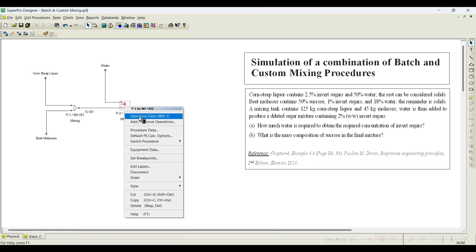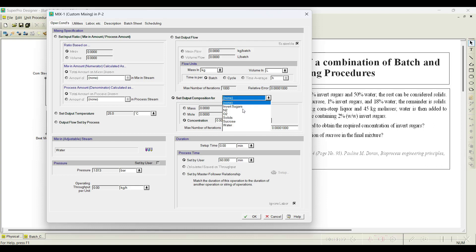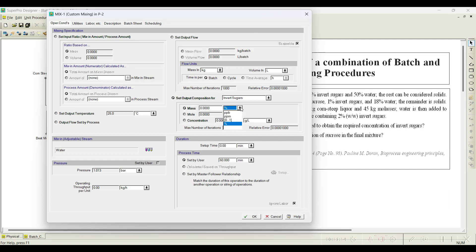This is again a continuous procedure — click OK. In the custom mixer operation, there are multiple parameters to set. There is an option to set the output composition. Select this option: it activates and you can choose which component (invert sugar) and what concentration is required. Multiple units are available — concentration, mole percent, mass percent. Since the problem specifies weight percent, select mass percent. Enter 2 mass percent as the required composition. Rest of the values go with defaults — click OK.